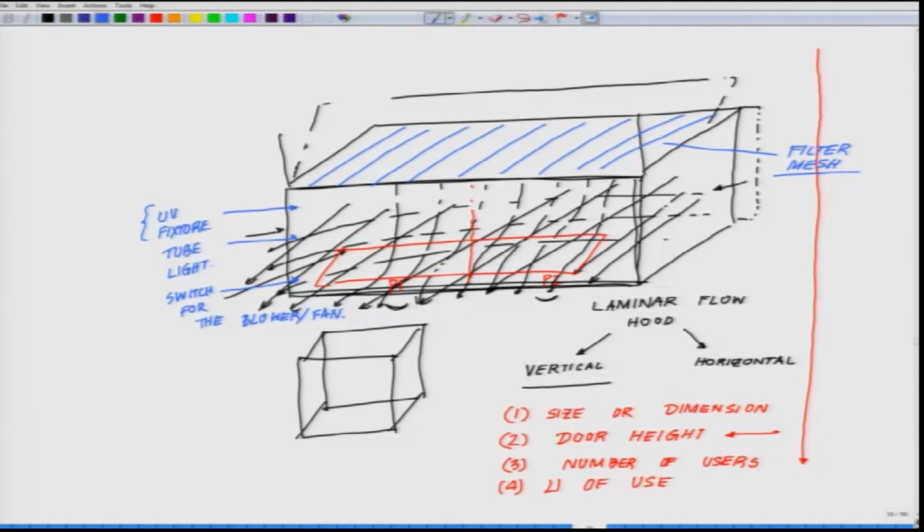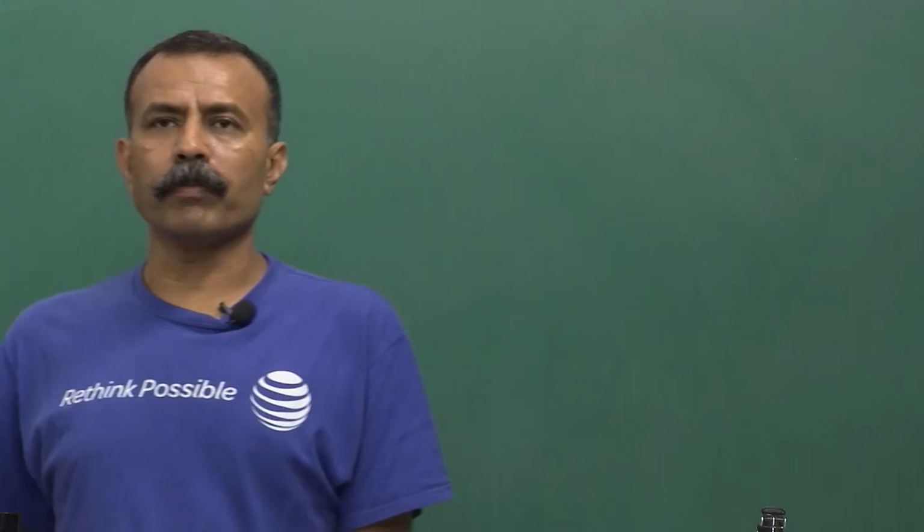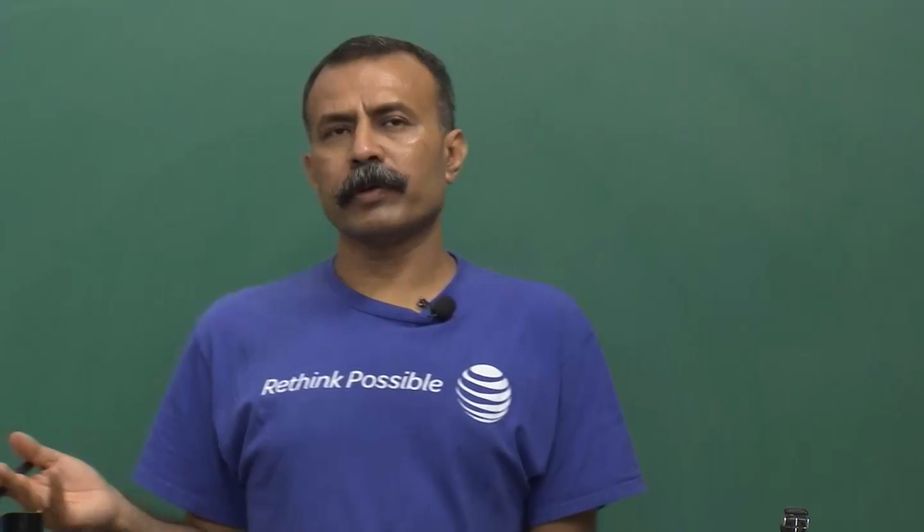Much earlier than that, what we generally do, step 1, is wipe the surface with alcohol before and after the work. Before you start the work, wipe it with alcohol properly and thoroughly, 70% to 100% alcohol.